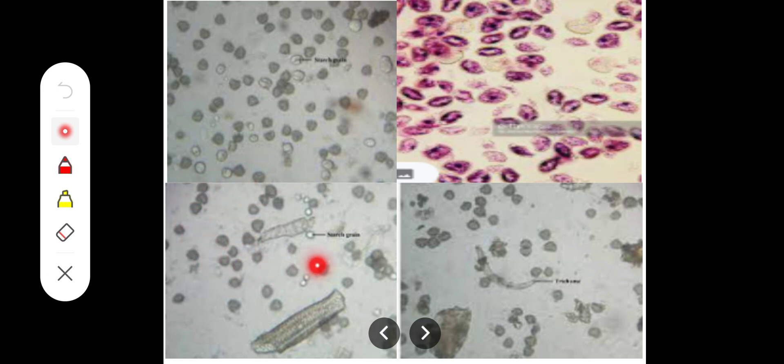The remaining dark ones of similar size and shape are the Lycopodium spores. We have to count those numbers, determine their weight, and fix them on the slide. After staining, you may see like this. These are different images of the slide taken to observe and determine the percentage purity of certain drug samples.